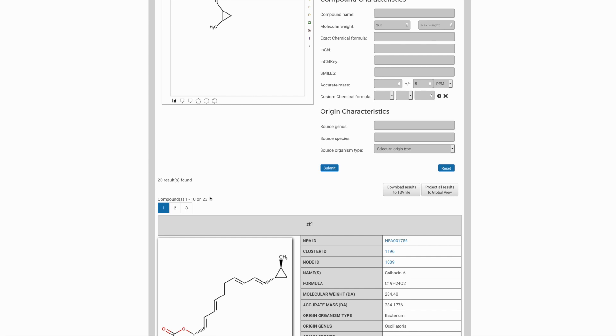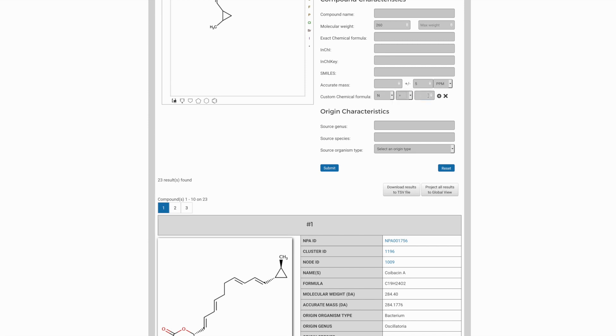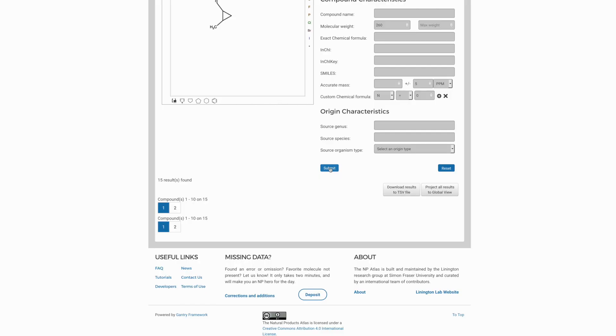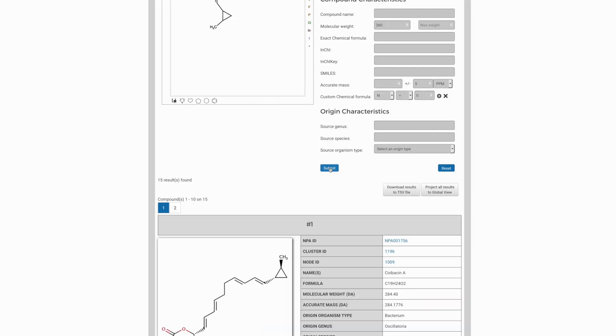We might also know, for example, from high-resolution mass spec data that the formula doesn't contain certain elements. So perhaps we know that this molecule does not contain any nitrogen. And so we can select the number of nitrogens to be precisely zero. If we submit this refinement, the number of candidates goes down from 23 to just 15.